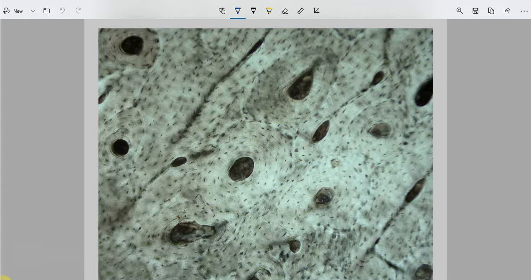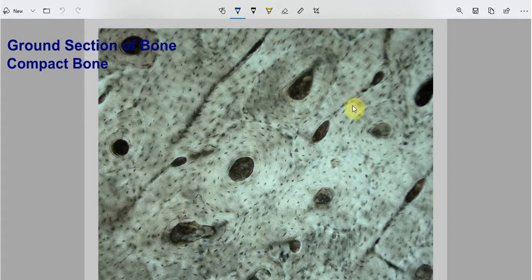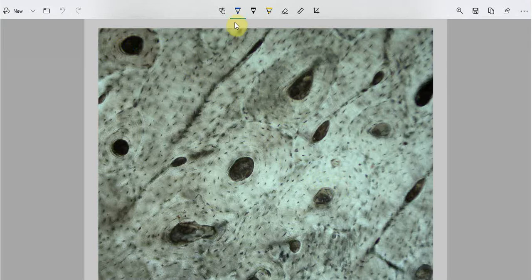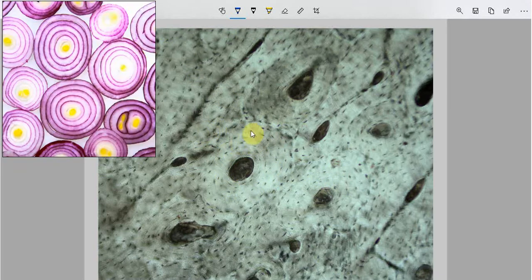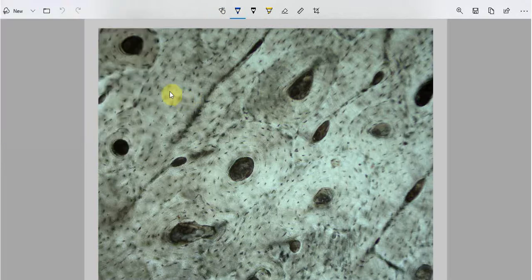This is a ground section of a compact bone. As you can see in this histological slide, the bone is deposited in layers like the layers of an onion. You can see different layers of bone, both circular and longitudinal. These layers of bone are known as lamellae.